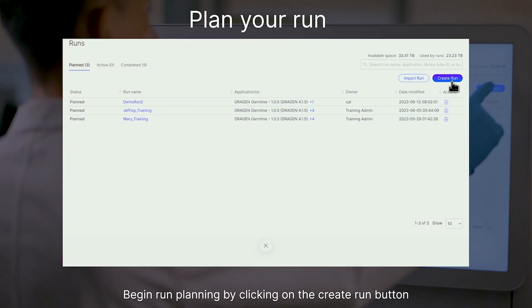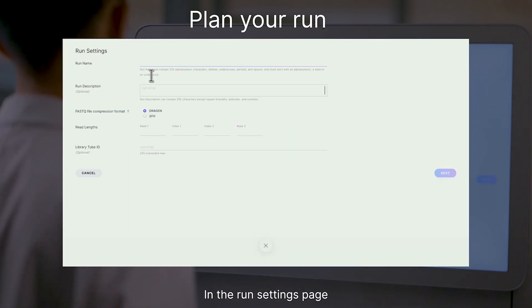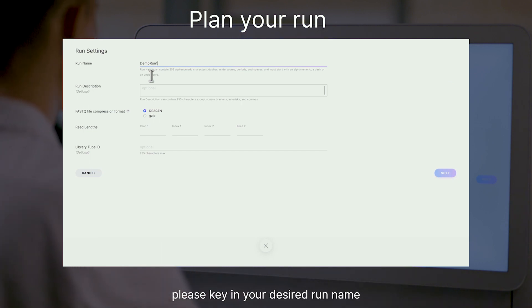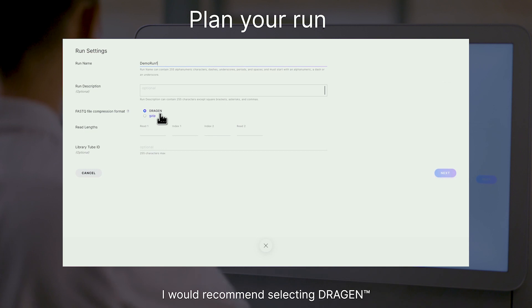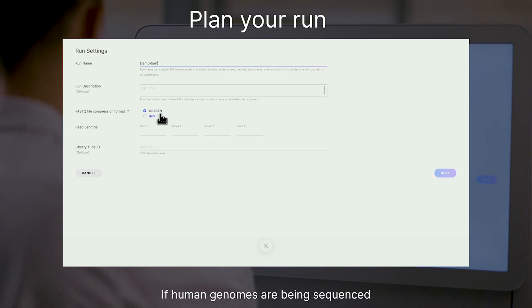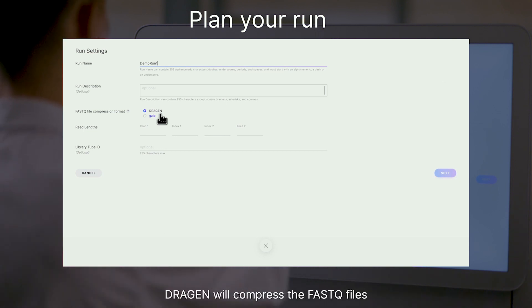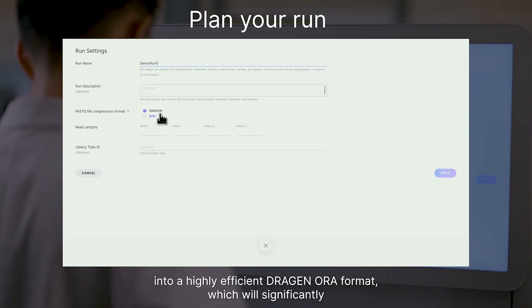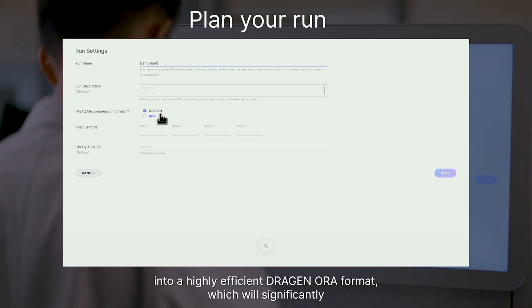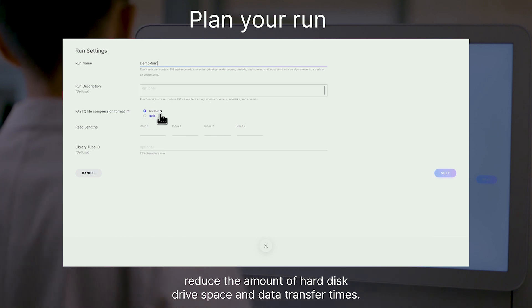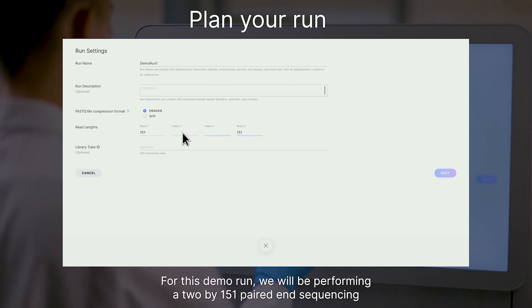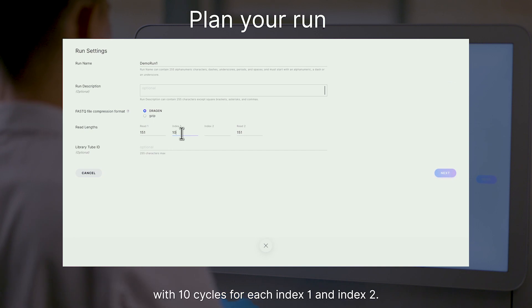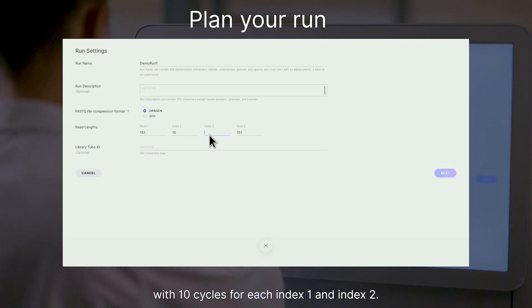Begin run planning by clicking on the Create Run button. In the Run Settings page, please key in your desired run name. For FastQ file compression format, I would recommend selecting Dragon if human genomes are being sequenced. Dragon will compress the FastQ files into a highly efficient Dragon Aura format, which will significantly reduce hard disk drive space and data transfer times. For this demo run, we will be performing a 2x151 paired-end sequencing with 10 cycles for each index 1 and 2.